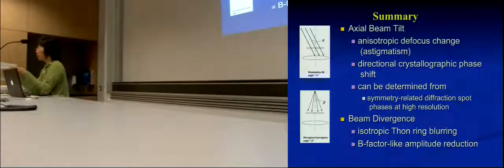So theoretically, it should be possible to do that on your original image before you even do any averaging. I don't know in reality if it works or not. Now we tried some of this on single particle, and it didn't work out very well. The peak that we got at the end wasn't better. The resolution we got wasn't better, or it's just insignificant differences. So maybe the correction wasn't done right, or as you transform forward and back with all these formulas, maybe somewhere something is not quite exact. So it actually lost some resolution. Anything else? Okay.